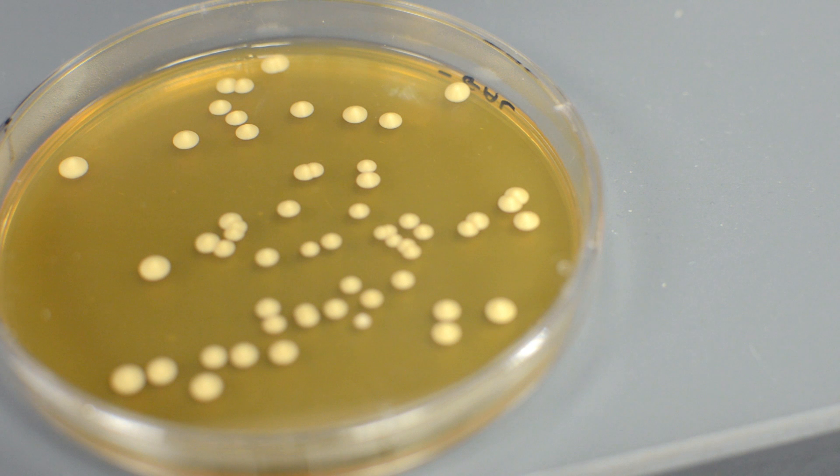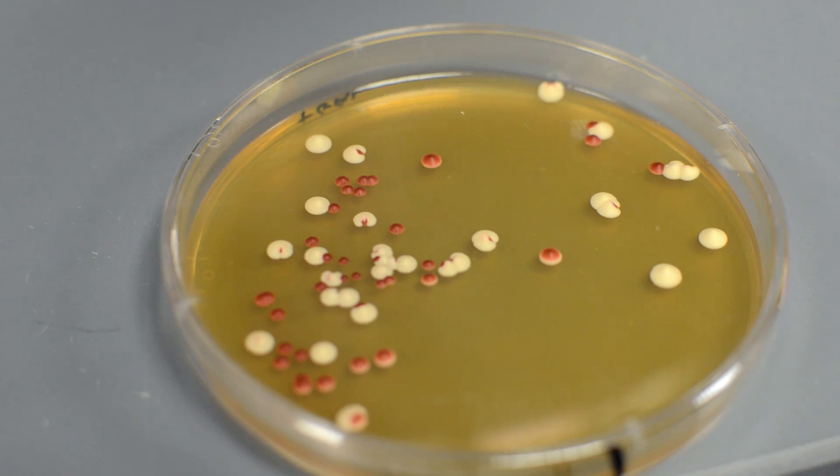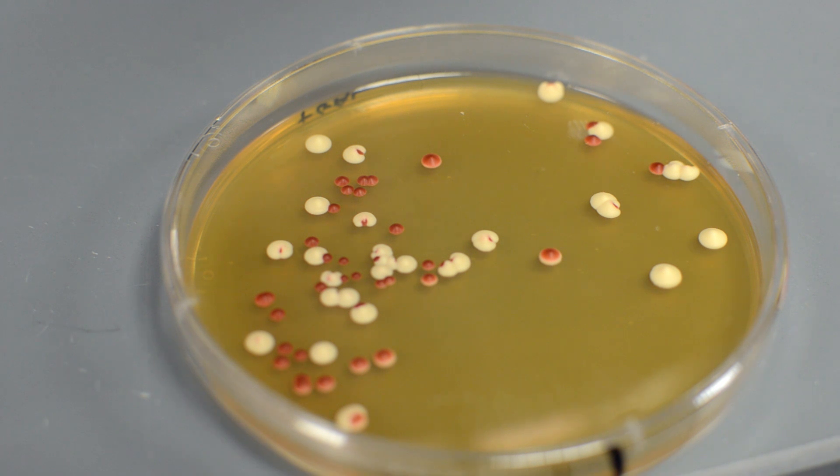As you can see, in the yeast where we didn't turn CRISPR on, all the colonies are white. But in the yeast where we did, we have a mixture of red and white colonies. So CRISPR cut and disabled the gene in those red ones. Now that we know the basics of how CRISPR works, let's talk to some grad students on campus to see how they're using CRISPR to ask questions in their research.